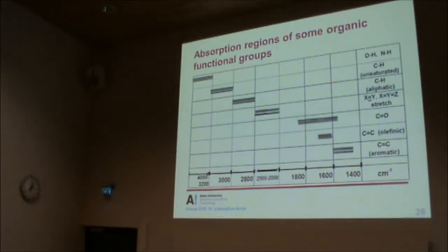Okay, so now we've seen CH3, and then we added hydroxyl to it, we added carboxyl, we added carbonyl, we added amine, and we also saw aromatic phenol. So now, if you analyze all these compounds, you will see that most of these bonds fall in one range of values. So you can come up with this general table where you can tell all the OH hydroxyls from any molecule that you take, they'll fall in this region, OH and NH.